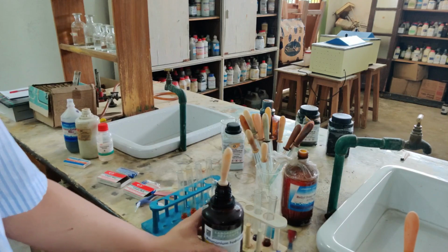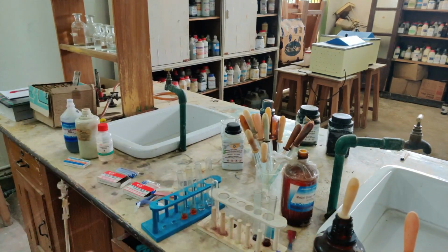So I have shown you both the solution as well as the paper in terms of the litmus, that is in terms of your red litmus and blue litmus. Now let's go to methyl orange.